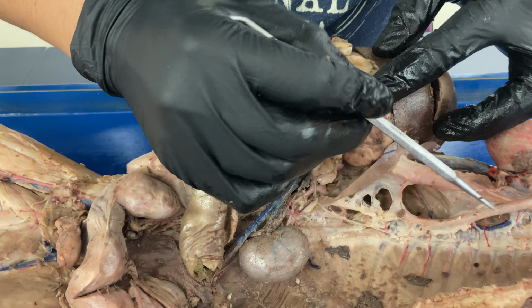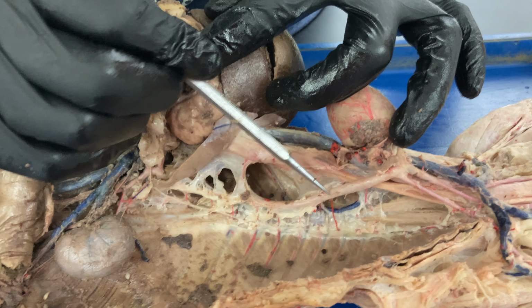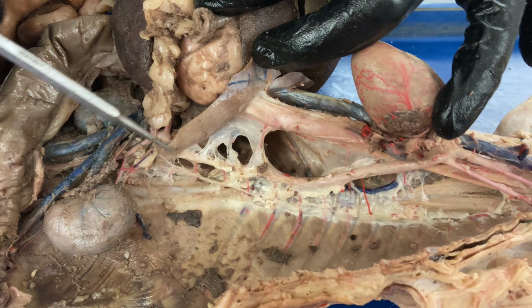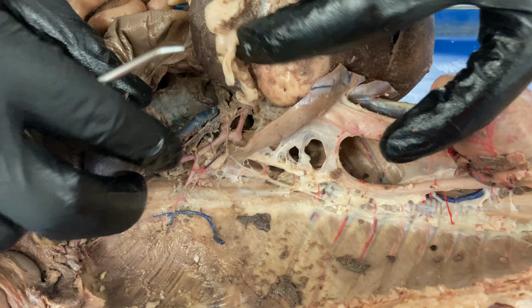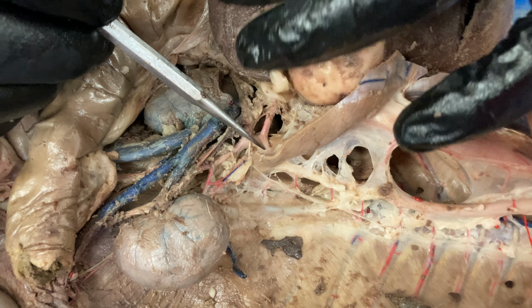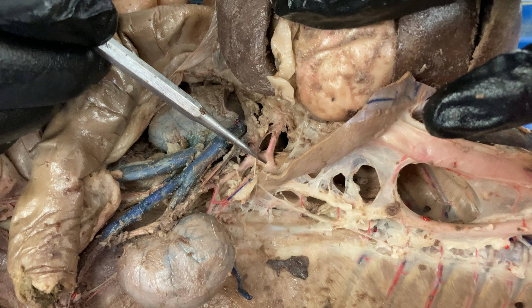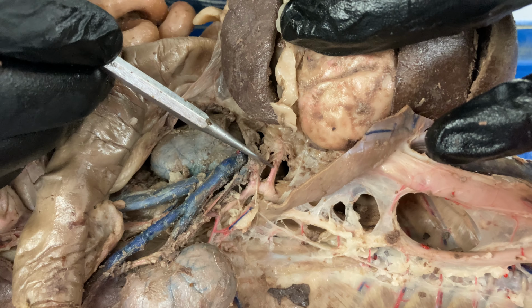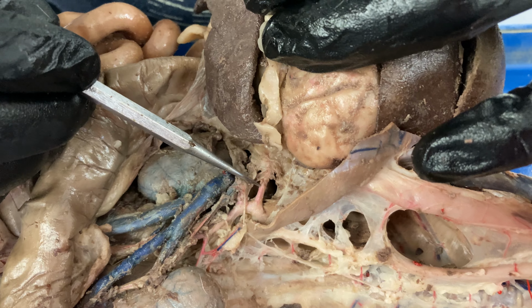So we're going to see the descending aorta as it comes down right here. Here's our diaphragm, so it pierces through the diaphragm. Here's the piercing right there, okay? And so it enters into the abdominal cavity. The first branch, as we enter into the abdominal cavity, which is this one, this would be your celiac trunk.